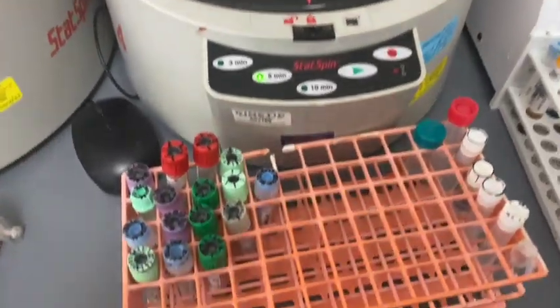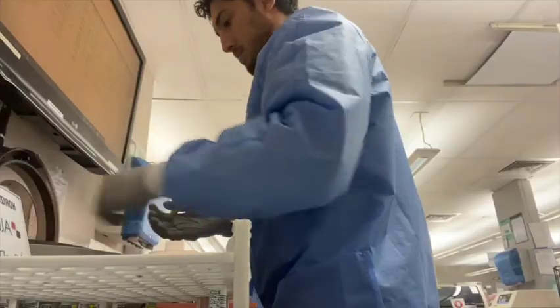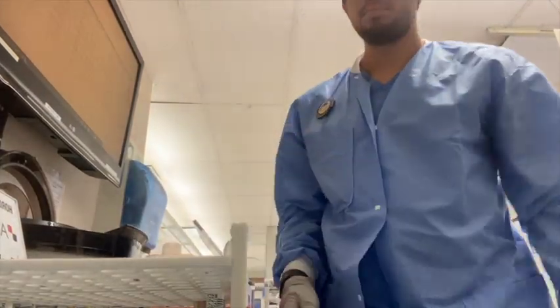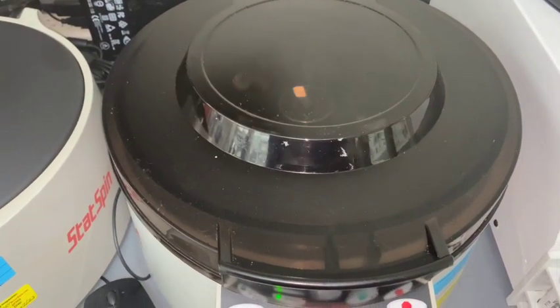Once I have marked the specimen as received, I'll go ahead and begin to centrifuge it, which means load it into this machine. And the point of this machine is to spin it to separate the red blood cells from the serum or the plasma. Here is the machine, and it's about done.